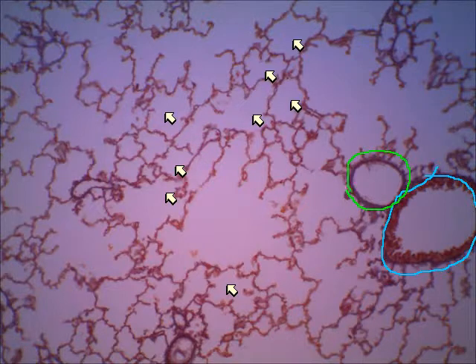There's a blood vessel. That's probably a little blood vessel right there. There's another tiny one right there. Okay, these smaller blood vessels, these last two I circled, don't worry about. That larger one, the first one I circled right here.